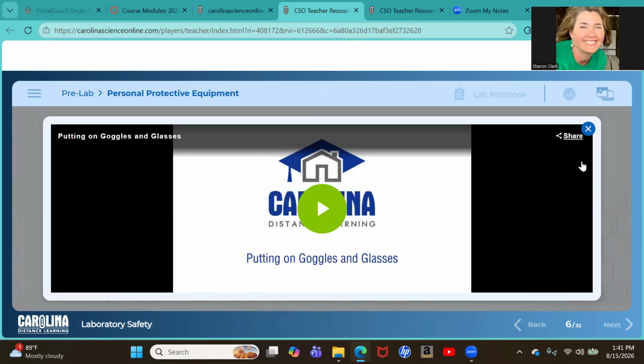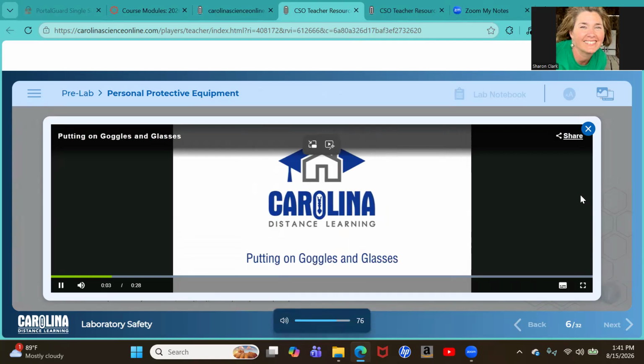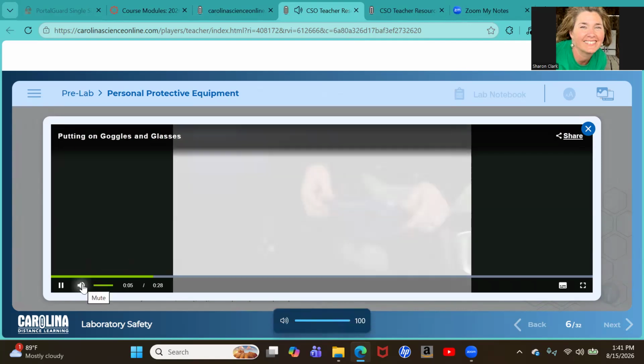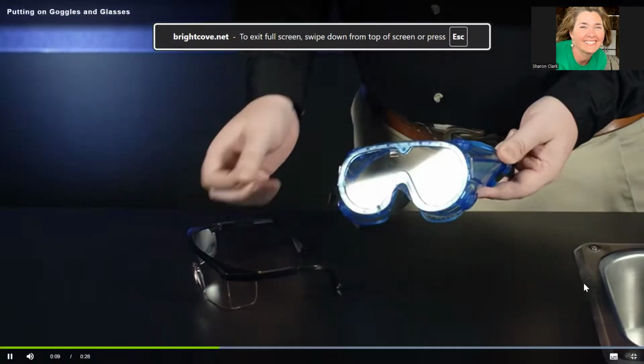Let's watch this quick video here on how to put on your goggles that will come in your kit.